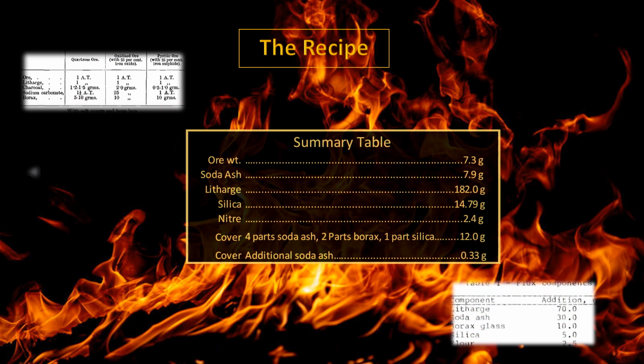In this case example, the Class 2 ore was composed of 50% chalcopyrite, 8% nickel arsenide, and 42% quartz. I have shown the calculations in respect to the charge table. Adding up the calculated results summarizes the required flux material, the quantity to be used, and the requirement of any cover layer that would be needed. The flux requirements for this ore are shown.